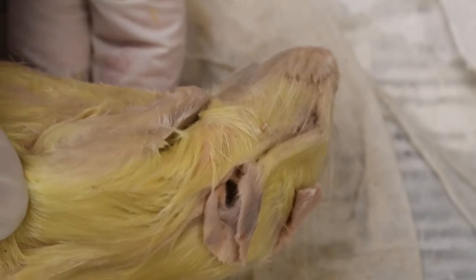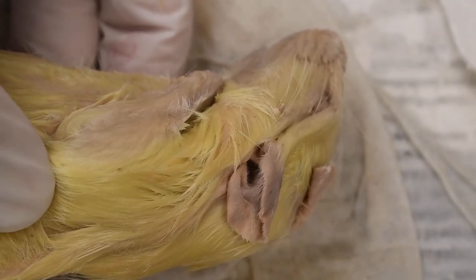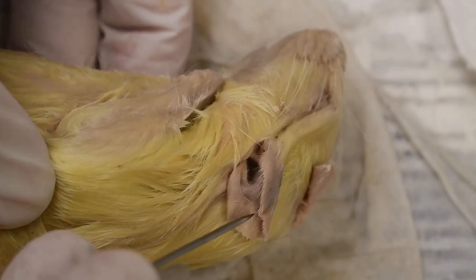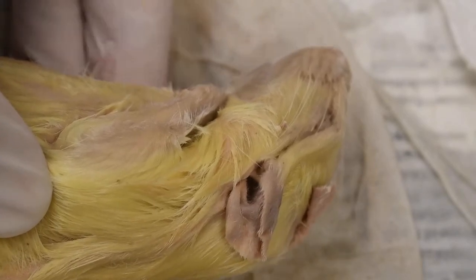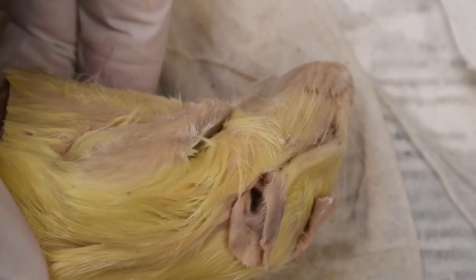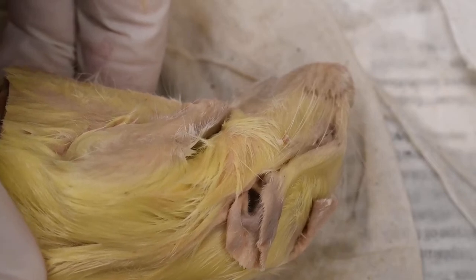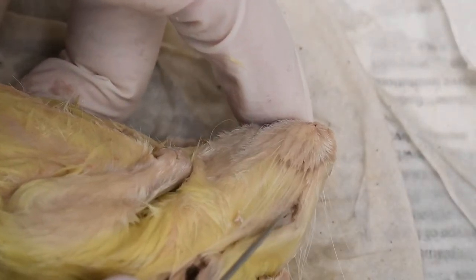Just like the frog, rats and other mammals have a tympanum or eardrum, but it is set at the bottom of an external auditory meatus. The pinna is essentially a sound collecting device. Compared to other tetrapods, mammals have extremely good hearing, mainly because they evolved to be nocturnal, I guess. Okay, so there you can sort of make out the eye.